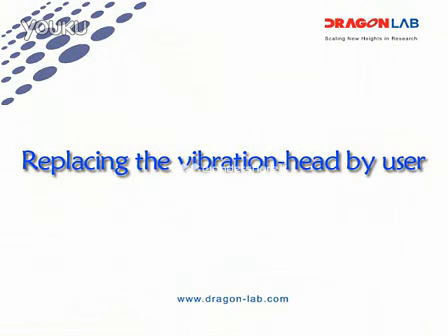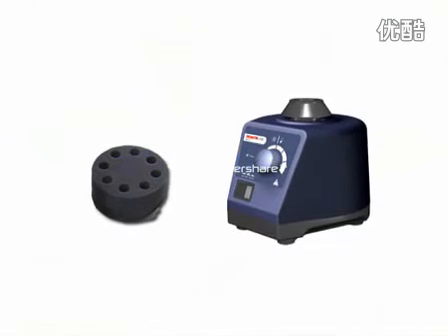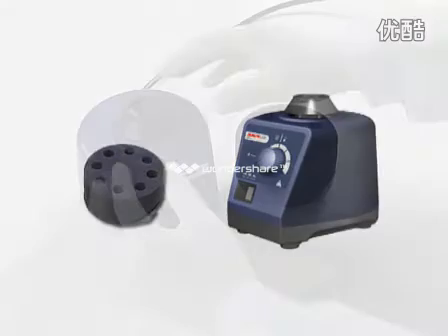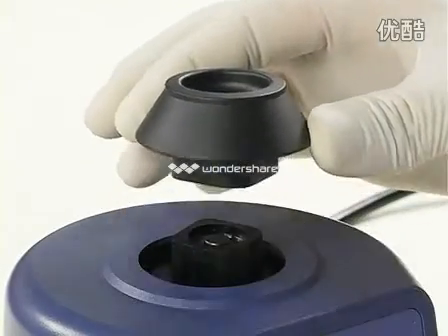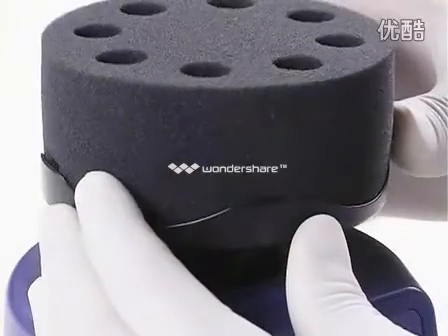Replacing the Vibration Head by user: according to work requirements, select the appropriate Vibration Head. Remove the existing Vibration Head by pulling it vertically upward. Put the selected Vibration Head in and press it vertically downward.